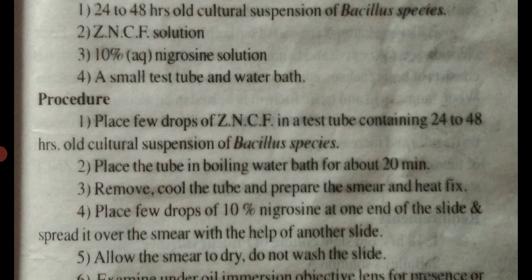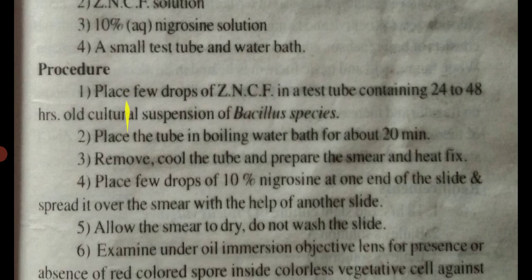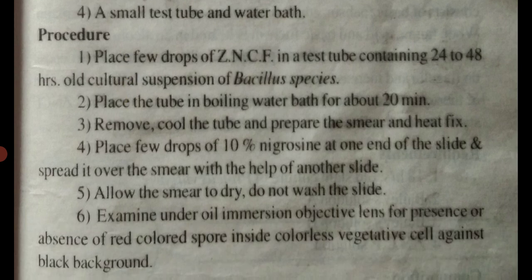Then, third point, remove the tube from the boiling water bath, cool it, and take a loopful of suspension from that tube onto a clean glass slide, prepare a smear of it and heat fix. After this, place a few drops of 10% nigrosin at one end of a slide and spread it over the smear with the help of another slide. Then allow the smear to dry and do not wash the slide at this time.